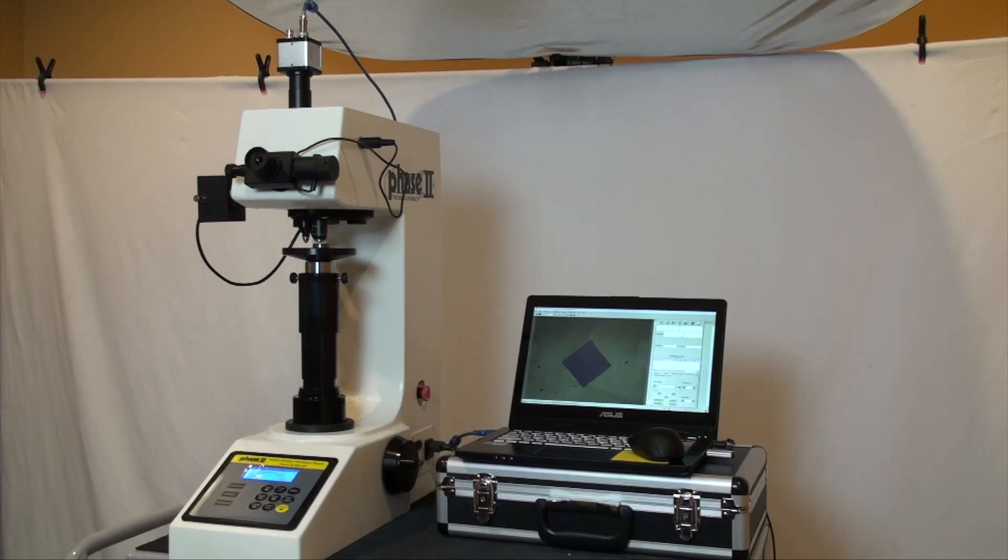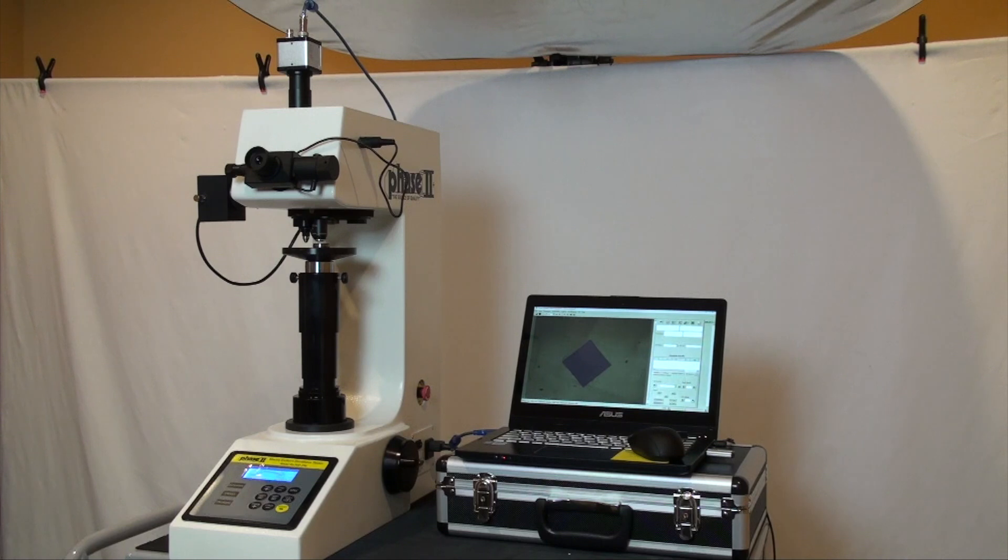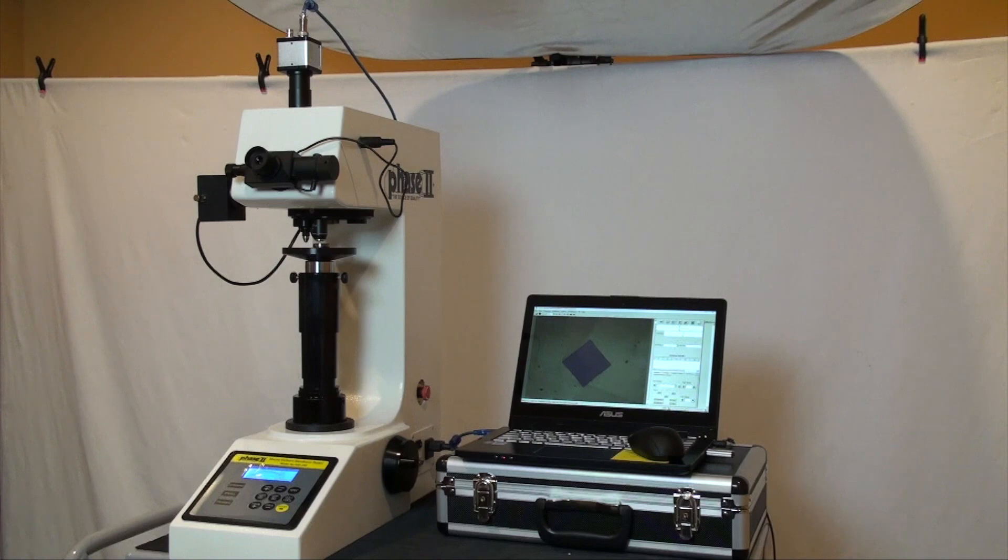Note that should anyone prefer to use this system without the digital optics system they are free and able to do so. Manual optics with drums are in place and keypad can control all aspects of the test. However today it's quite rare to bypass the easy use of a computer screen to see the indentations clearly and work with data in a digital format.